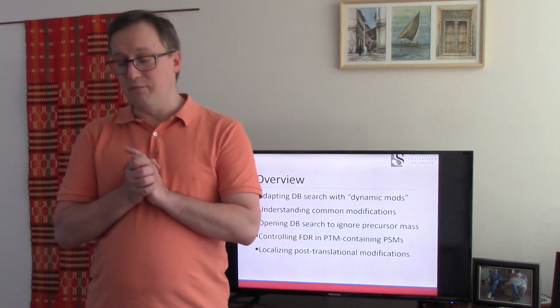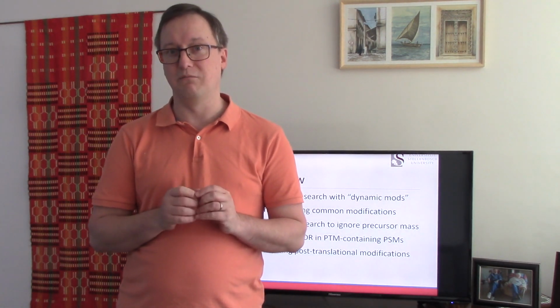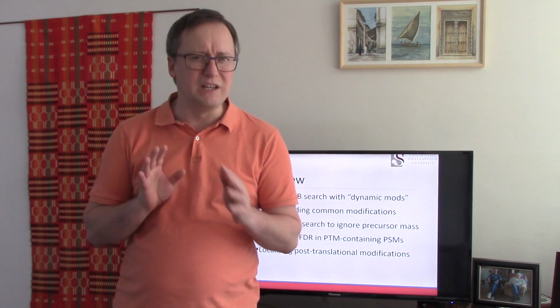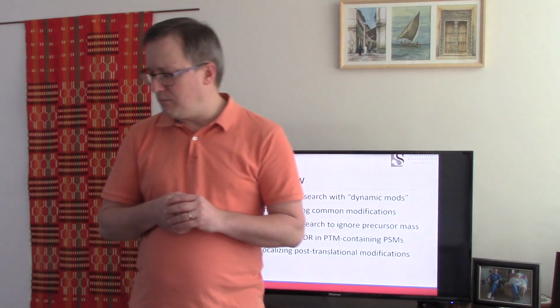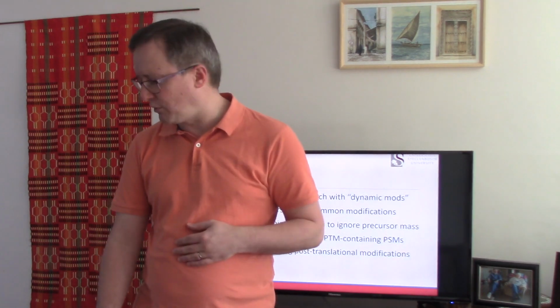Okay, so from there we're going to talk about a rather new approach called open search that's become really in vogue for finding sets of modifications. We'll try to talk about some of the limitations of this algorithm that may hold back some of the promise that it offers. But I hope that you'll come away as a more seasoned user of the open search approach.